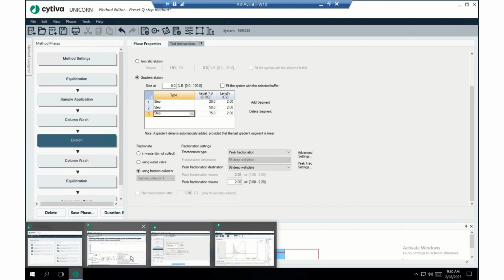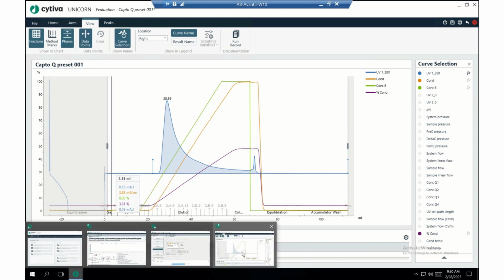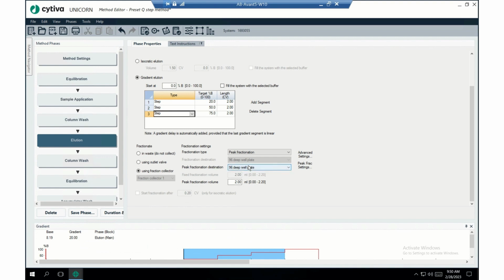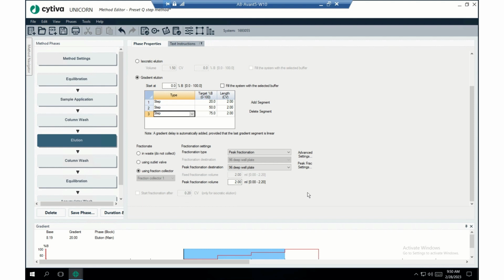So let's go back to the evaluation module and let's see here. 6.8, why don't we start collecting at 30 milliabsorbance units, and we'll stop collecting at 30 milliabsorbance units. Let's do 50. I think 50 would be better. So peak frac settings. So we're going to change this to 50. 50 milliabsorbance units. Okay. All right. Save this method.